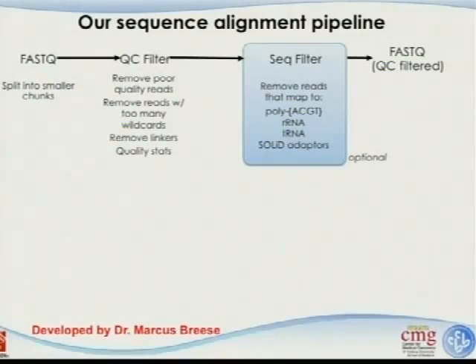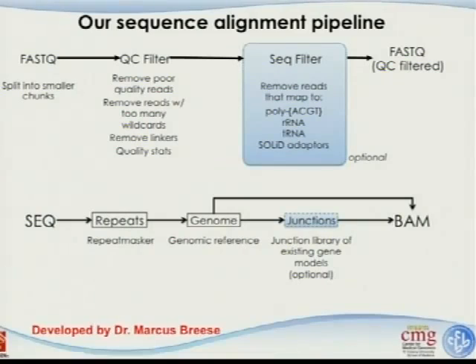Quickly, this is our strategy to do that. I'm not saying this is a good strategy or the perfect strategy. There is no perfect strategy. It's just based on the considerations we have; this is currently what we are picking. So with all these different steps, you can see that the quality control information you can do, but in the alignment part, what we did is we got a sequence, and then we first align to the genome, okay? And then we build a junction library.